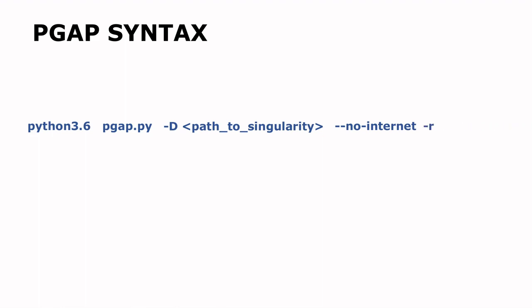And then we have the -r flag, and then the -d flag, and then after that we specify the -o, which indicates the output directory, which folder name PGAP should use to save the annotation, okay, the annotated files. And then finally we specify the generic.yaml file. So once you are done with that, then PGAP starts loading. So now let's quickly go and do the activity on the terminal.